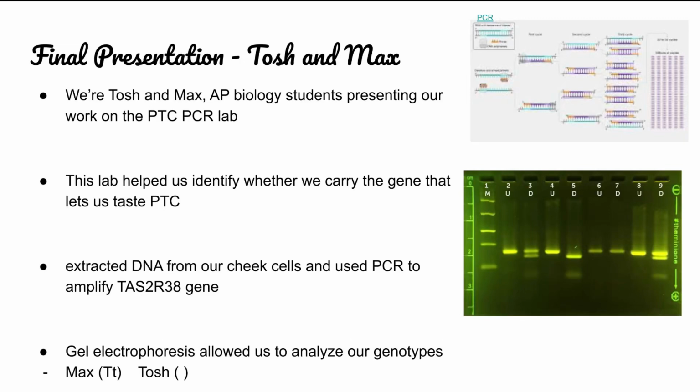Hi, we're Tosh and Max, and we're AP Biology students sharing our final presentation on the PTC PCR lab. This lab helped us figure out whether we have a specific gene that allows us to taste a compound called PTC. To do this, we extracted DNA from our cheek cells and used a technique called polymerase chain reaction, or PCR, to amplify the TAS2R38 gene, which is linked to PTC tasting.